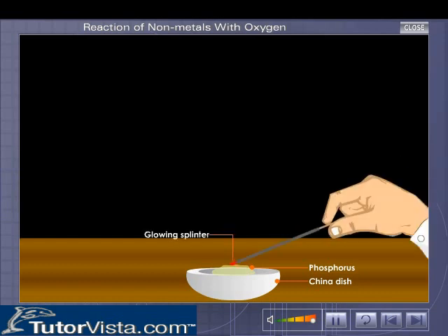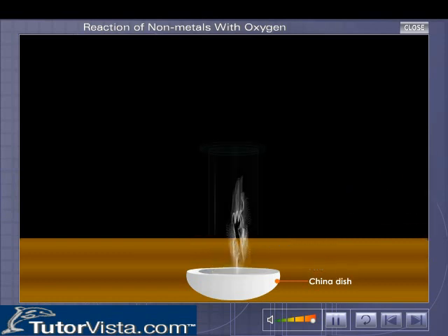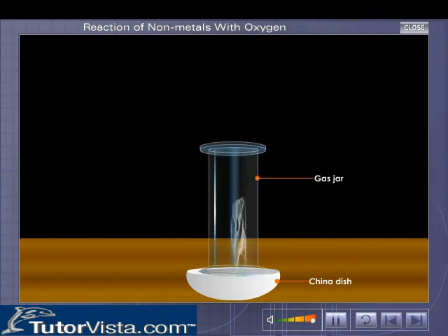Burn the phosphorus with the help of a glowing splinter. Cover it with an inverted gas jar.